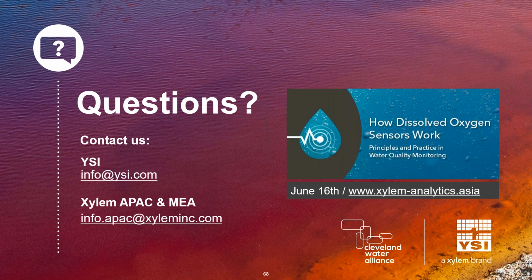Okay. Well, I wouldn't use the word better in that case. It's more like more appropriate. Gel has certain advantages in that it has a slow outflow. So if you want a probe that is compact and easy to maintain, generally gel is the way to go. For instance, all of our environmental probes must be gel filled because that's much more compact. It allows us to have a compact design that can go underwater and the whole thing can be immersed and work just fine. Refillable has many advantages too.